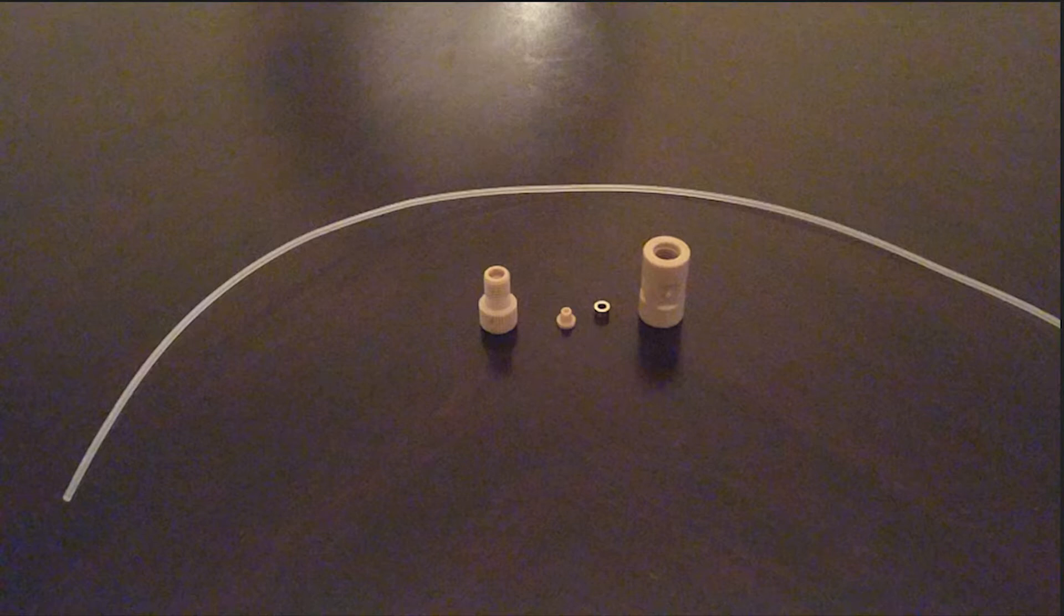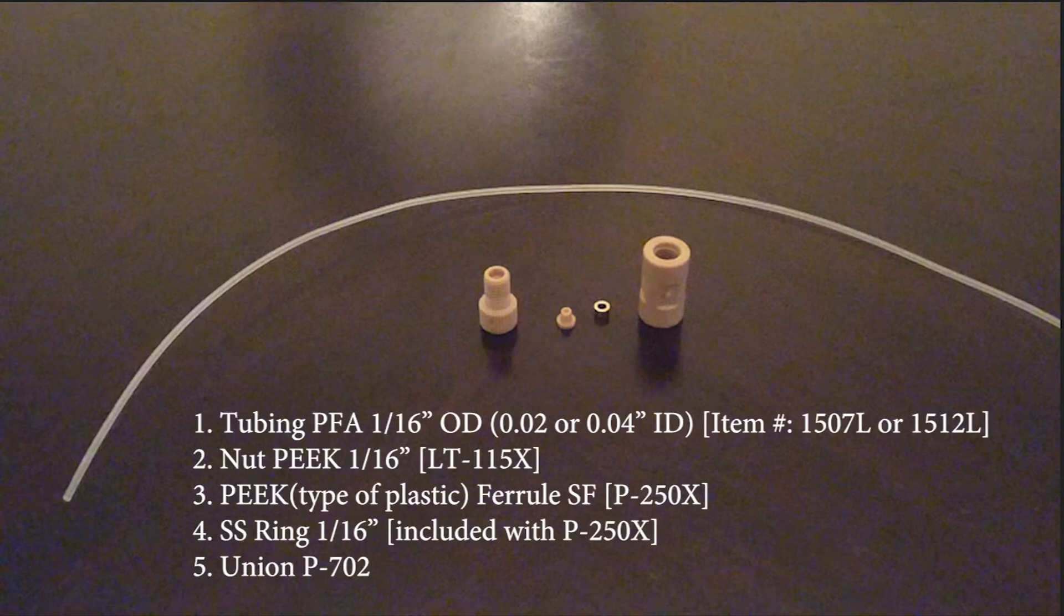For the first section of the video, we'll be assembling the tubing connector. These are the following components: tubing PFA 1/16th OD, nut PEEK 1/16th, PEEK ferrule SF, SS ring 1/16th, and union P-702.